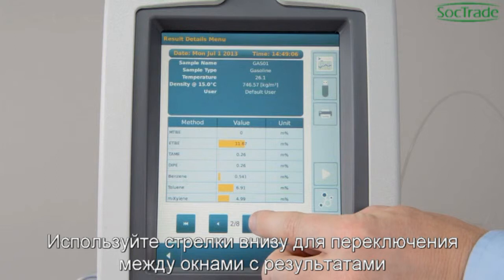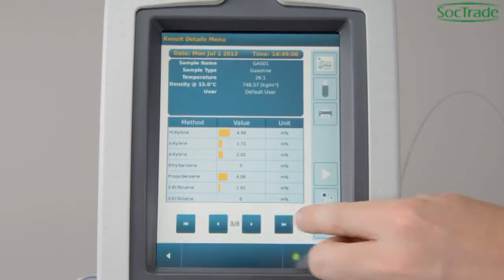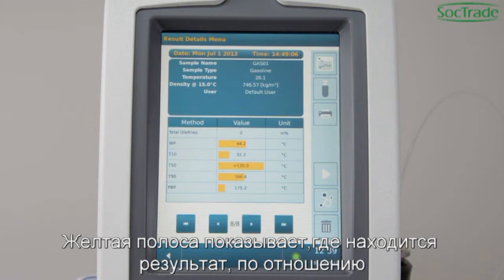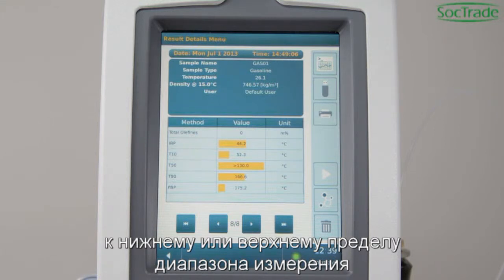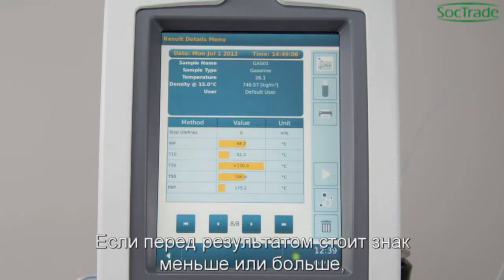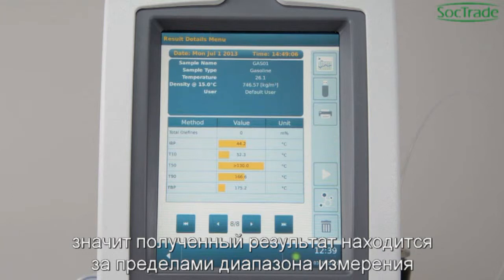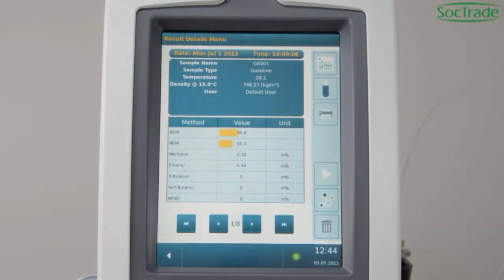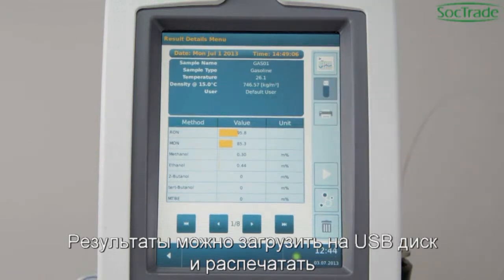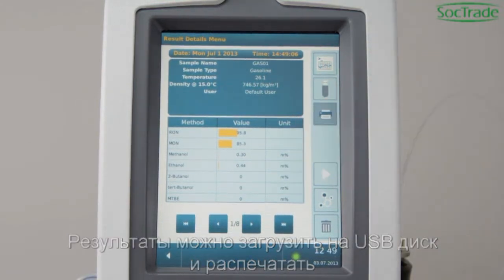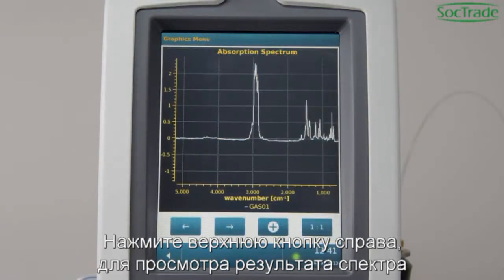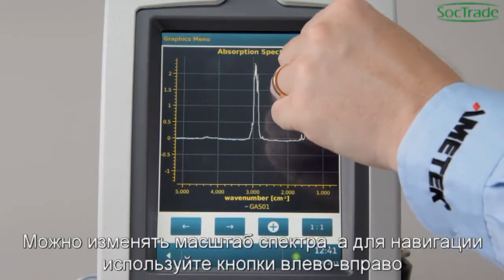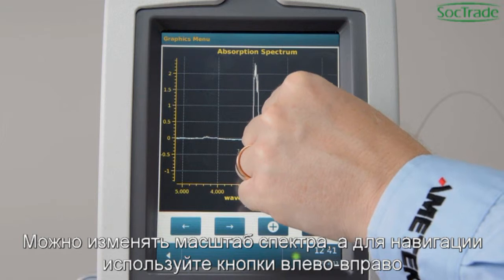Use the arrow buttons to flip through the result parameters. The yellow bar behind a result shows if your result is near the upper or the lower limit of the testing range. If the values 'lower than' or 'greater than' are shown, the result is out of testing range. Results can be downloaded to USB and printed. Choose the top right button for reviewing results spectra. Zoom in on the spectrum and use the left and right buttons to navigate.